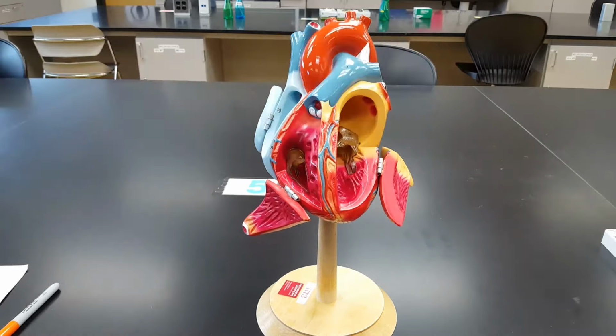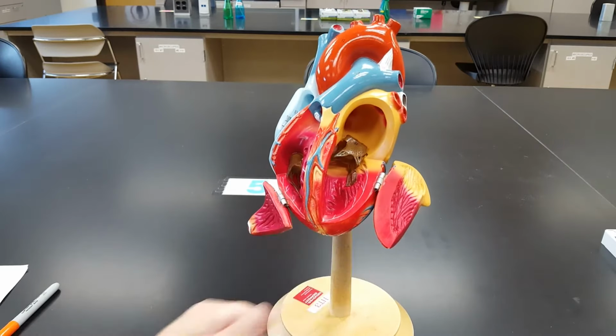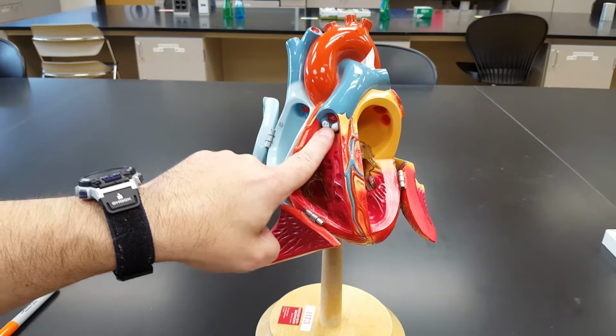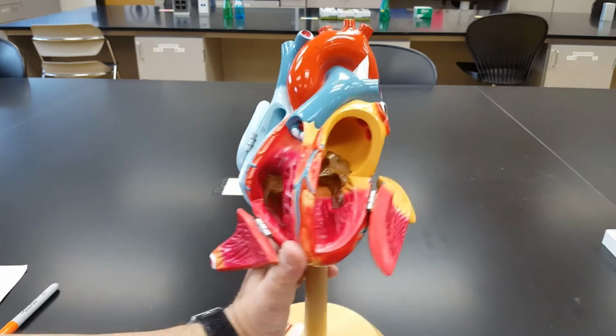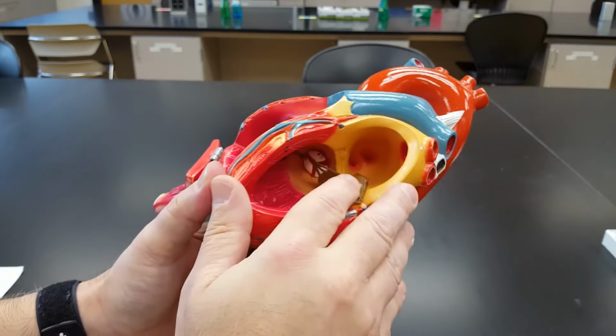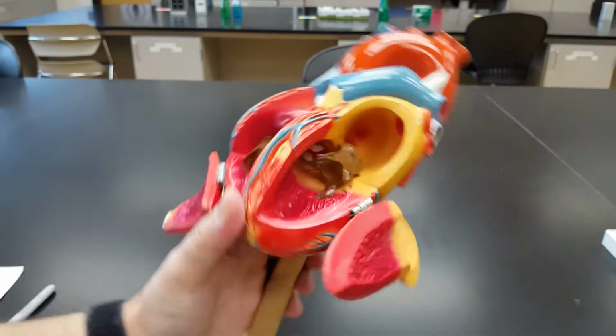If I open this one up, I can see the sort of rust-colored mitral valve separating the left atrium and ventricle, tricuspid valve separating the right atrium and ventricle, pulmonary semilunar valve, and aortic semilunar valve way up in there. See that aortic semilunar valve way up in there. Great vessels, 4 valves.